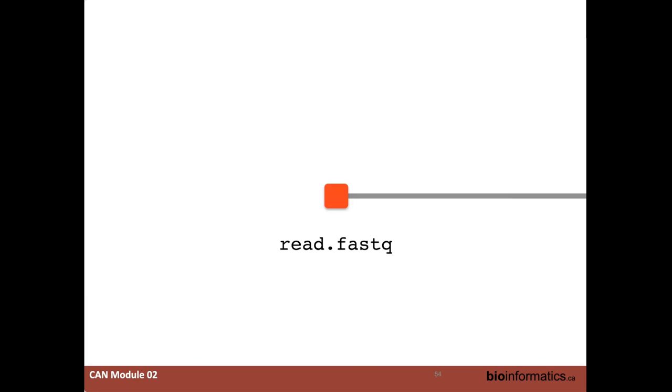I haven't talked about read lengths or anything along those lines, just the fact that we're going to get a FASTQ file for that little segment of DNA, which we're going to call a read. That's all you need to know. We know that four lines make up that FASTQ file, where we have the actual sequence, and every corresponding base in that sequence has a quality score of some sort. Okay, so that's one. We could just read through that entire DNA fragment. That's great.